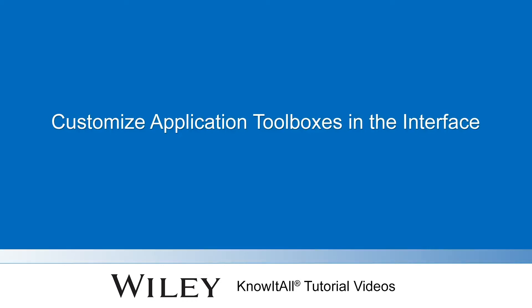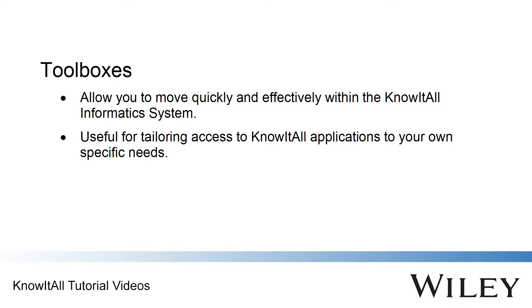Welcome to a demonstration of how to customize application toolboxes in the Know-It-All Informatics System. The Know-It-All Informatics System is a fully integrated environment with complete software and database solutions for chemical, analytical, and biological information.